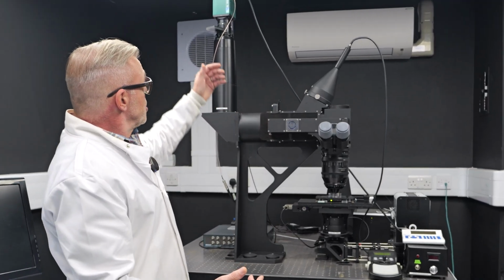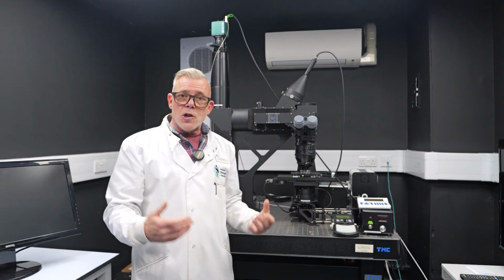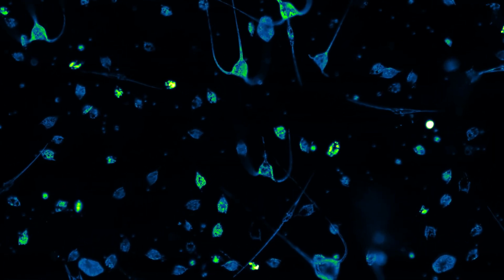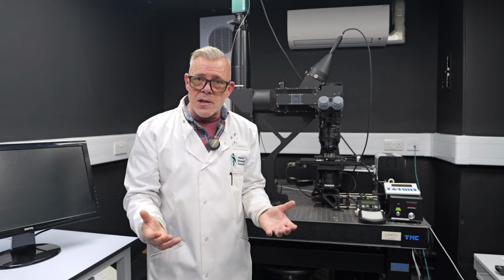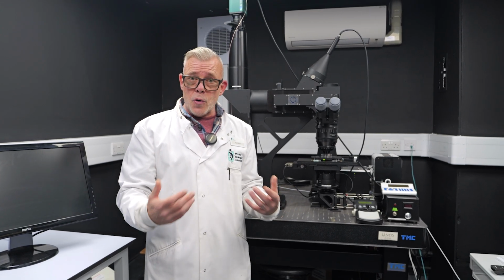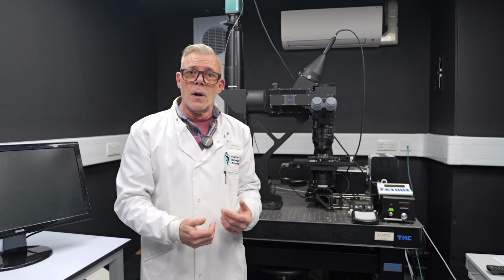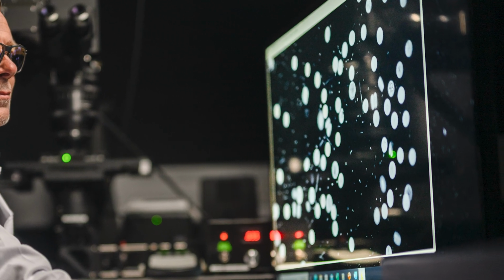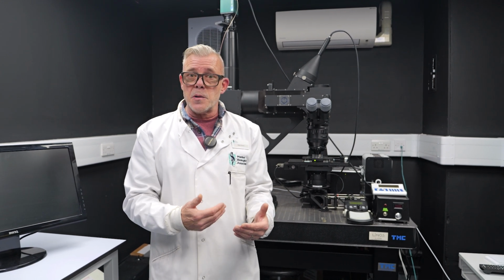And when used in combination with a high-resolution CMOS camera, we're able to image chlorophyll fluorescence down to a micron scale, where we have somewhere in the region of 1 to 2 microns per pixel. So we're able to capture very detailed images of chlorophyll fluorescence. We apply a protocol of very rapid light pulses that excite the chlorophyll. That then makes the chlorophyll fluoresce. That then enables us to say something about the photosynthetic efficiency and the light harvesting efficiency of phytoplankton populations on a per cell basis.